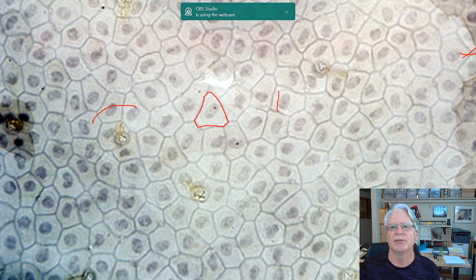I'm going to find out where, there it is. So look at this. This is something in the frog skin. This is actually an opening to a gland. So you can see the gland in the background right here, and this little pattern right here, that's the opening to the surface. So the frog's skin is producing something.